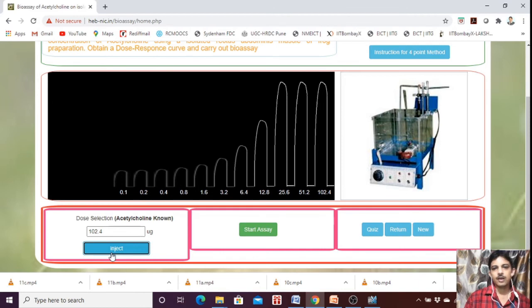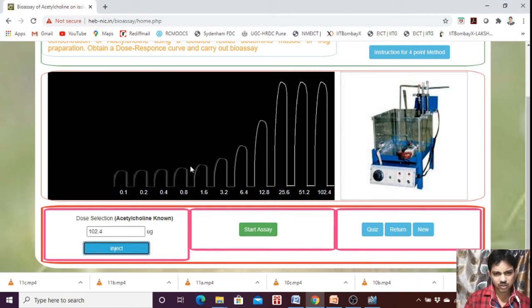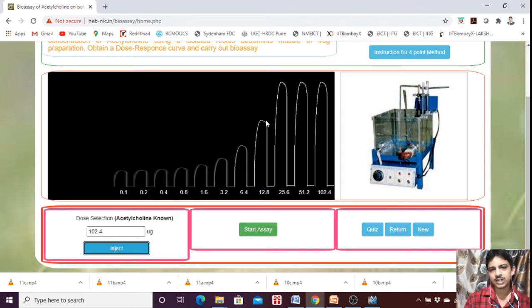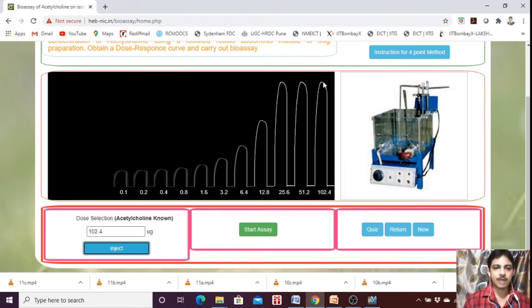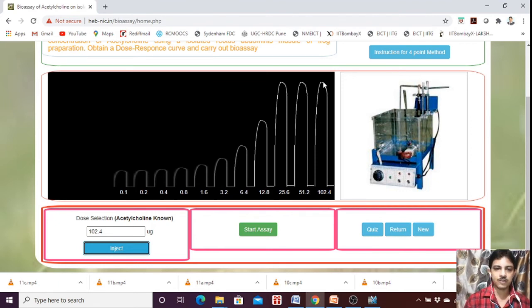Now let's see why I have given these doses. You can see that the response is almost negligible initially, and after 8 it starts to increase. This we can consider as submaximal because it is less than the maximum. This is the maximum response we are getting. This is how to perform the CRC using the software.